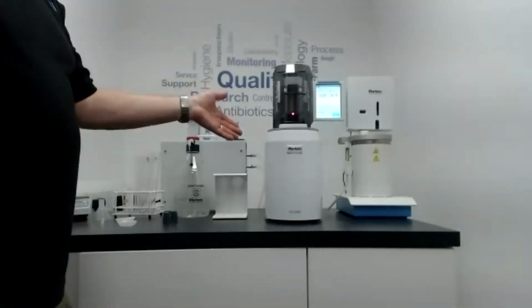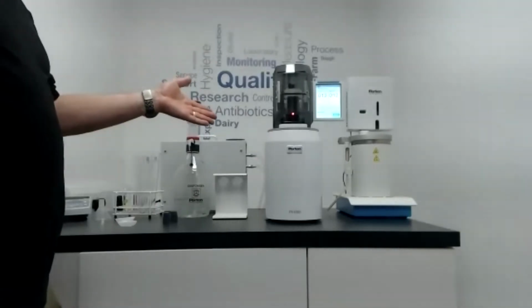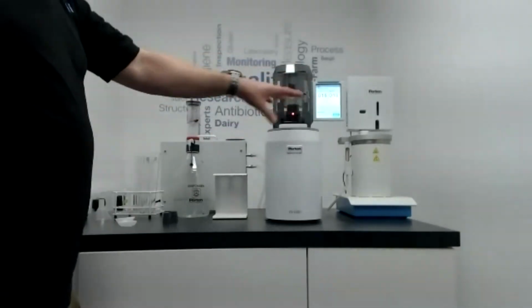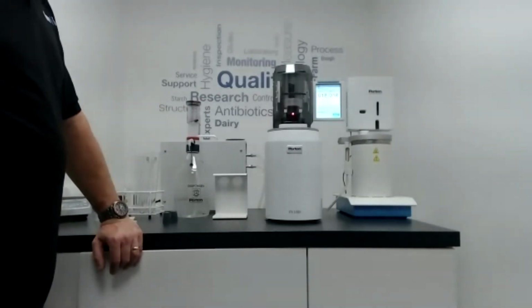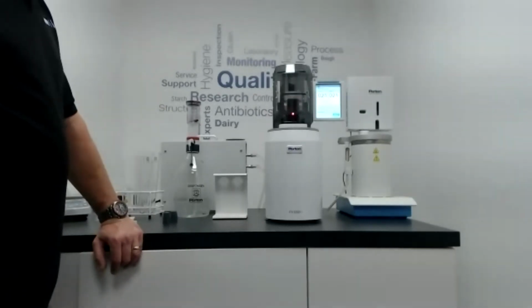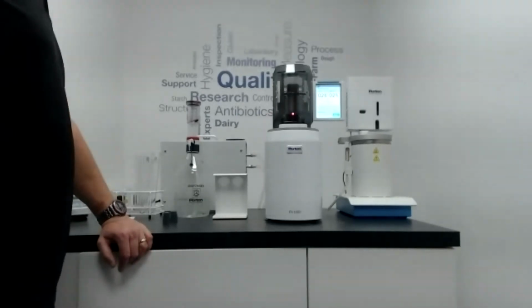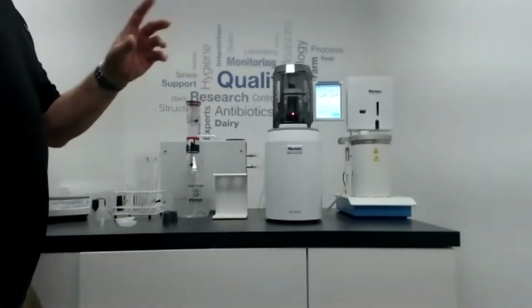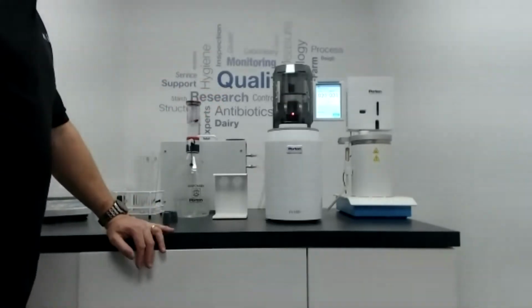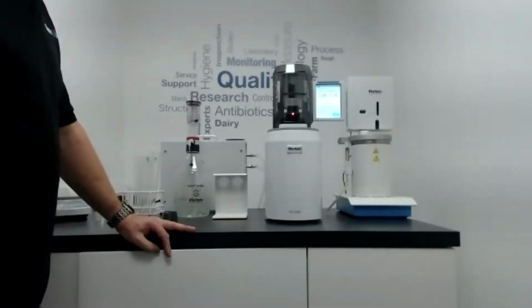Regardless of whether we're using a double or a single instrument, the shaking is the same, the stir is exactly the same, and the instruments work exactly the same way. They both count up to 60 seconds and then they're released. So I've put 2 samples in here, similar to what Jadala mentioned earlier in the presentation. One that's just a normal ground wheat sample, and one that we've added some freeze-dried grain to.